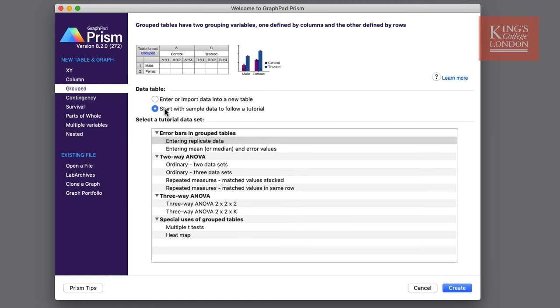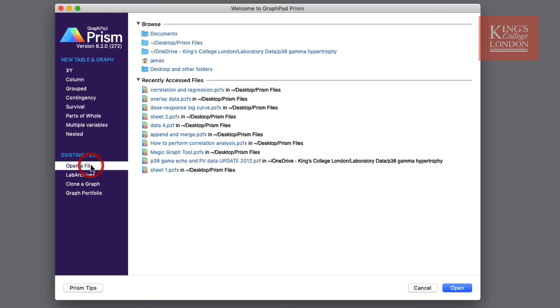If you're not starting from fresh but wish to open up an existing Prism file, under the existing file submenu you can choose open a file. You will see a list of recently accessed folders and recently accessed files and you can choose one of these should you wish to.